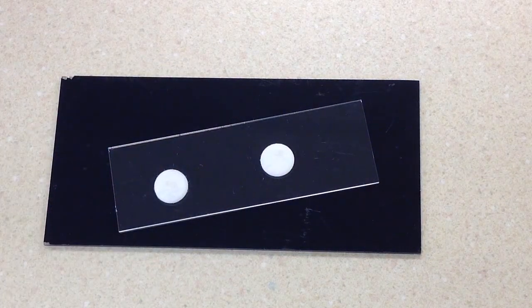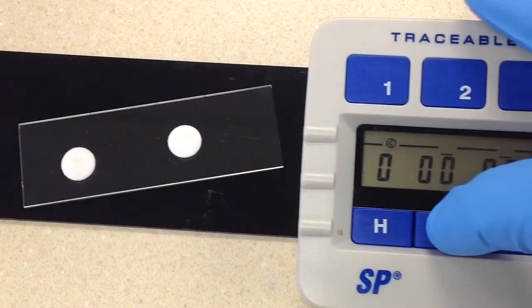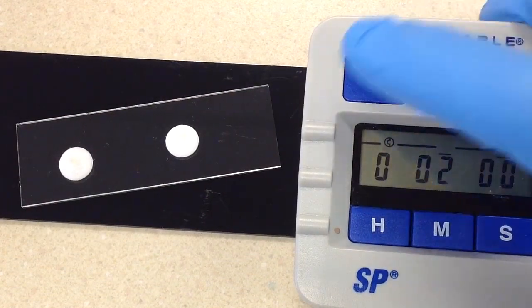The next step here is simply to let these incubate. I'm going to get my timer going for two minutes.